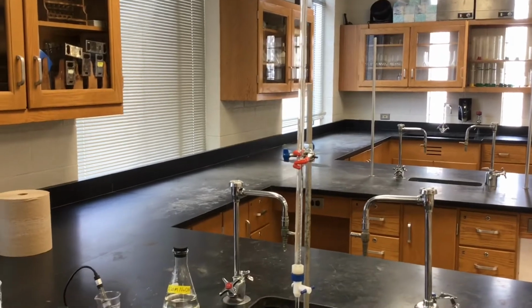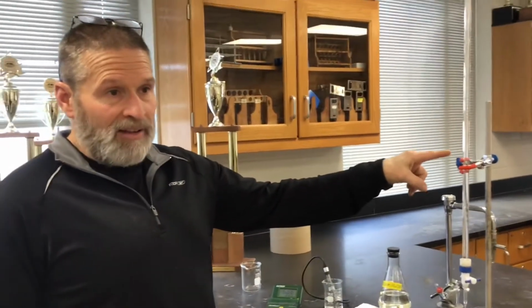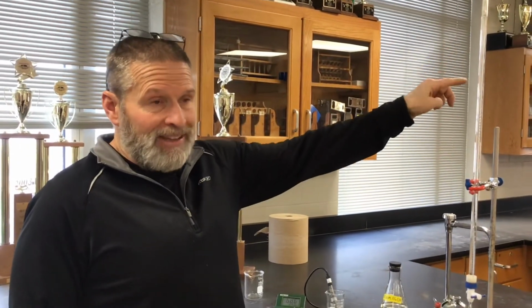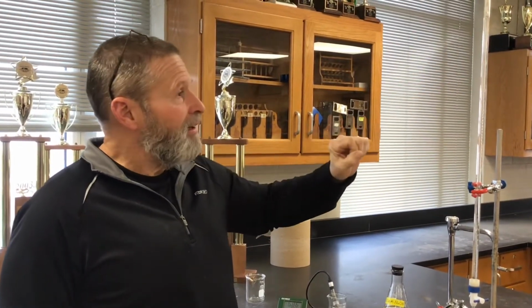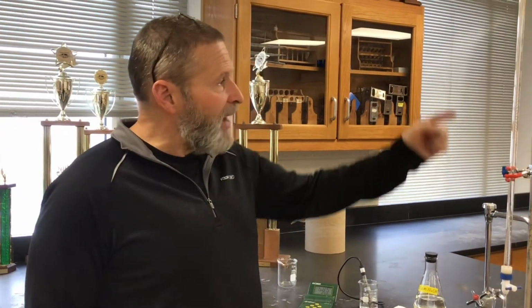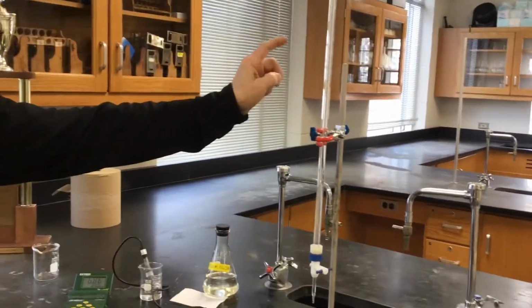So I always tell people this is like the equivalent to an electronic balance. It reads volume very accurately. You can estimate to the hundredths place. And so if you know the volume that you've used and you know the molarity, you can easily calculate the moles that you've added. And so what we've got today is a strong base, sodium hydroxide, that is in our burette.